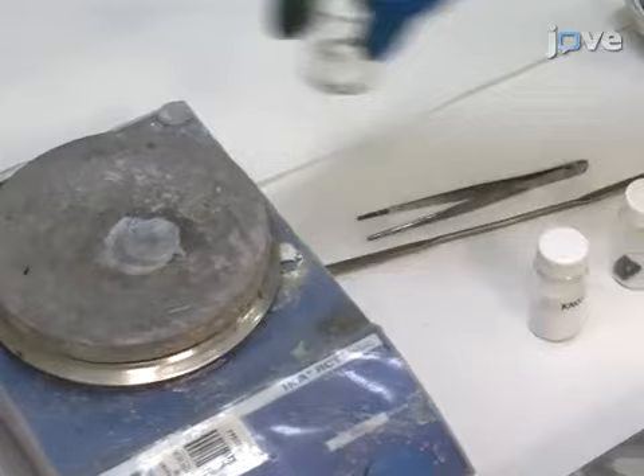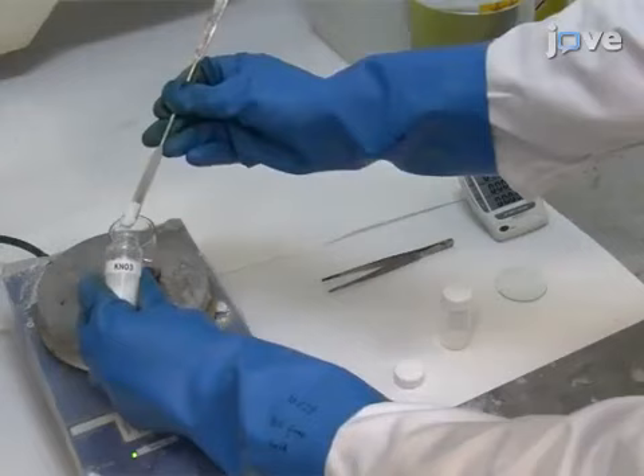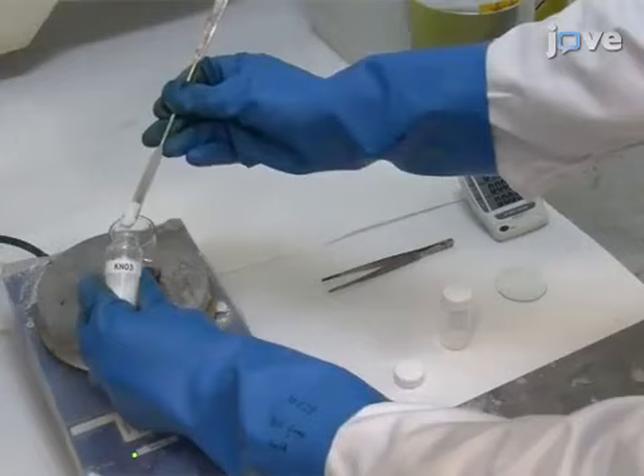To begin, place a beaker of concentrated sulfuric acid on a hot plate at room temperature and insert the BDD. Add potassium nitrate until it no longer dissolves. Then, cover with a watch glass and heat to approximately 300 degrees Celsius.